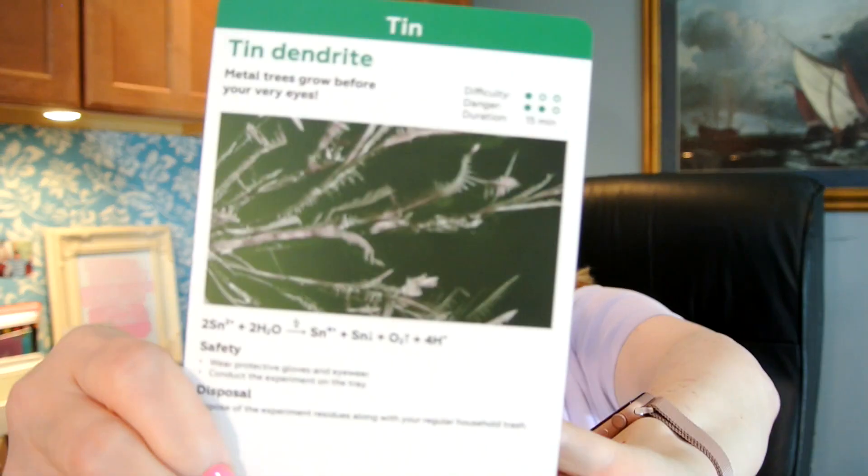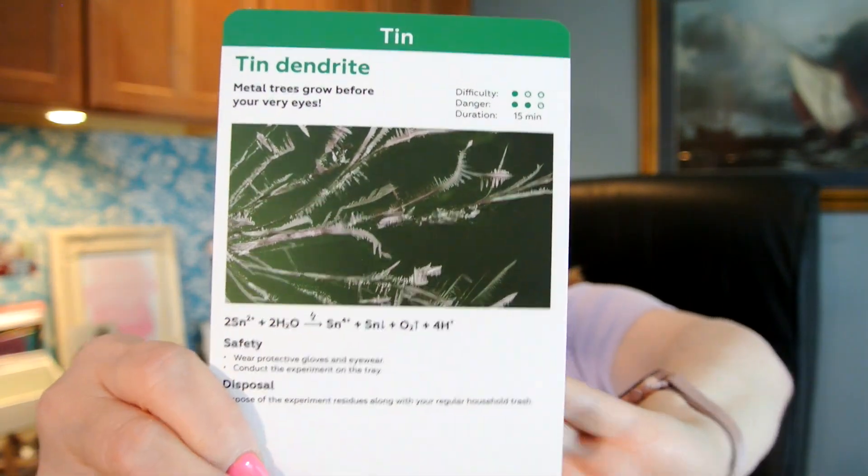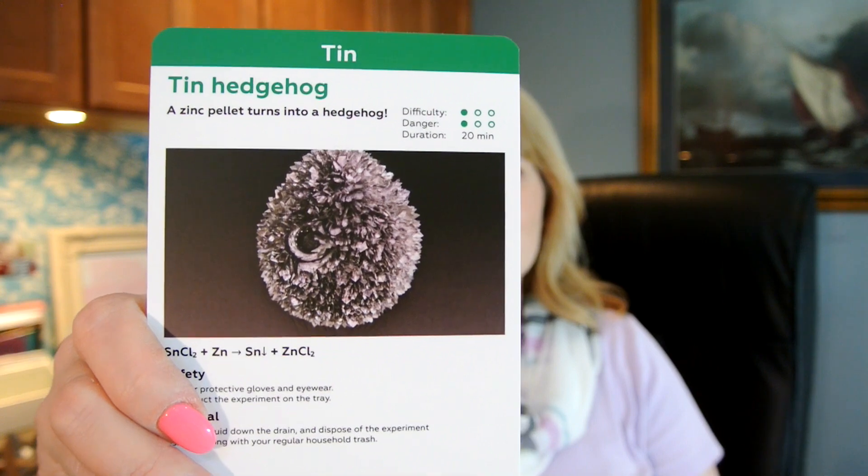And then — a zinc pellet turns into a hedgehog. That sounds really cool. Here's the first one and the hedgehog looks really awesome. On the back of the cards are step-by-step instructions how to perform these experiments.